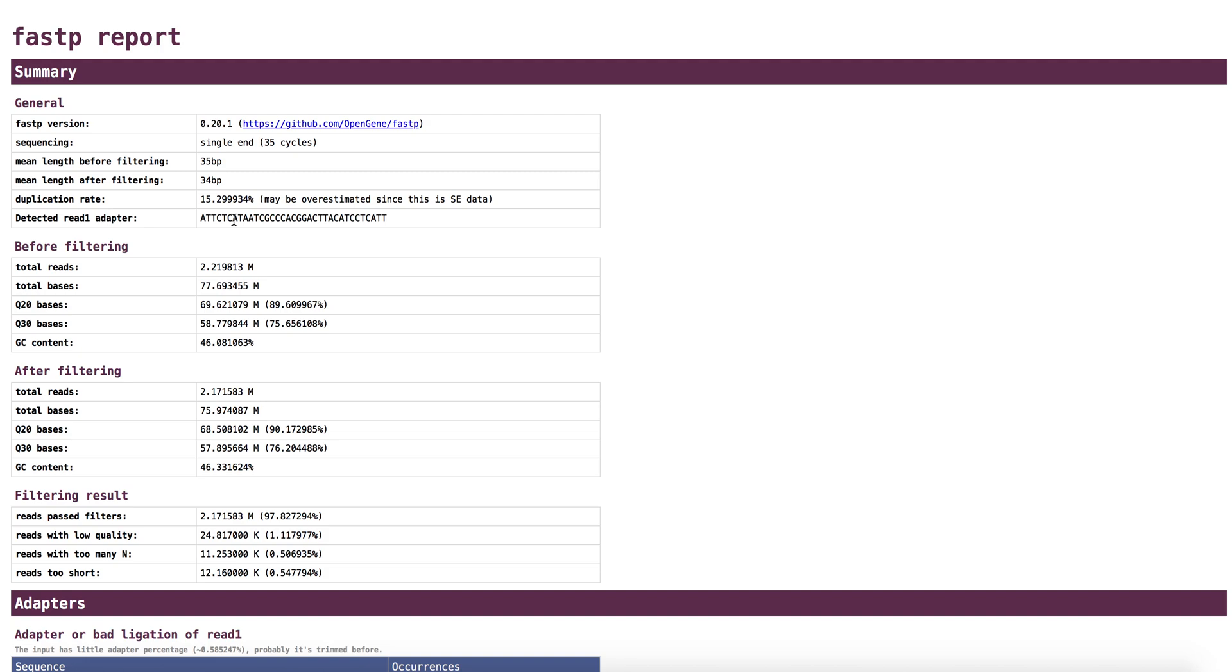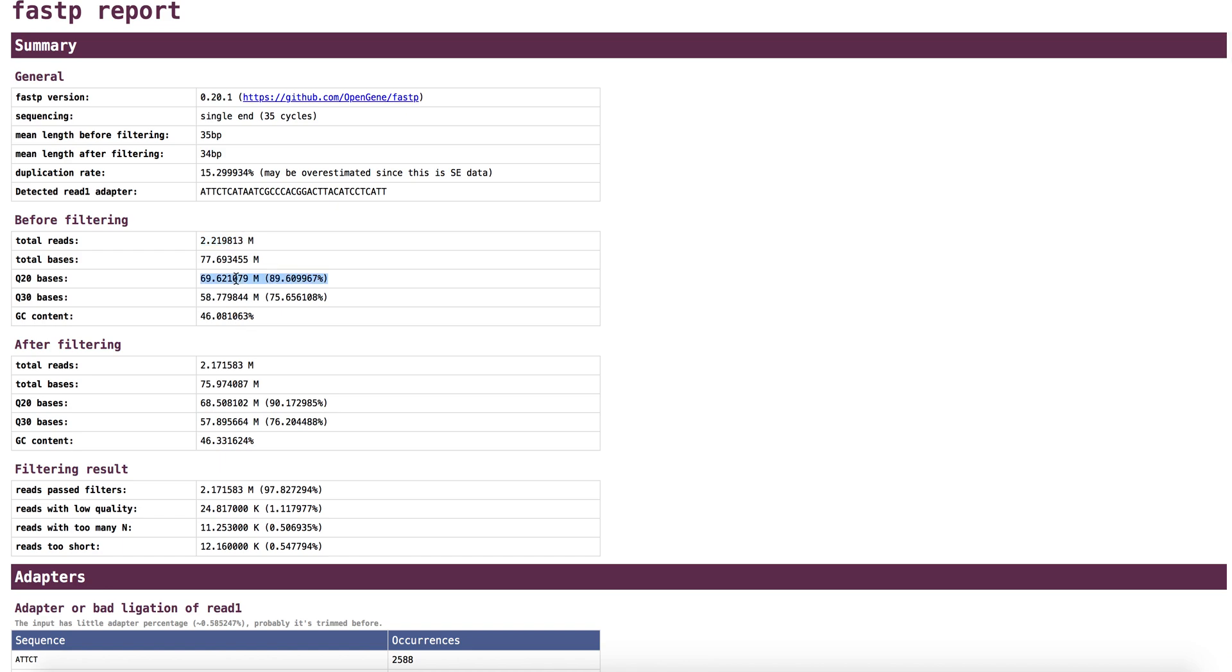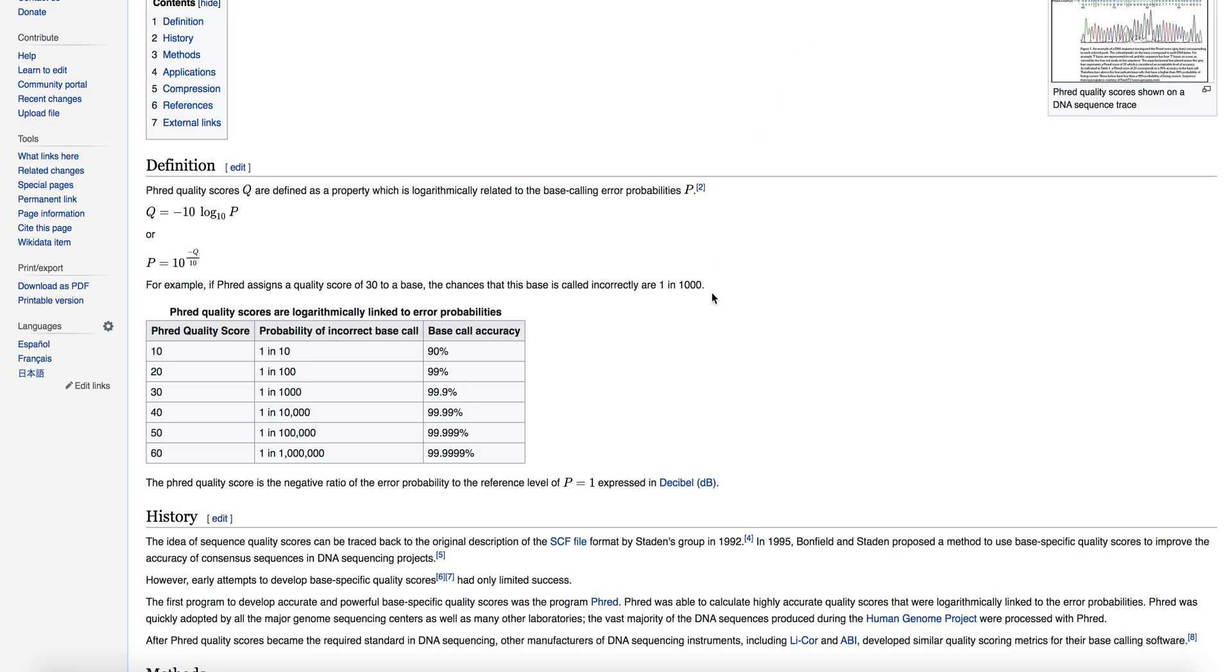And if it's detecting an adapter that is quite popular, it will also provide the name of that adapter, the TruSeq adapter or whatnot. This was actually a very small file. There's only 2.22 million reads. It provides what percentage of bases are greater than 20 PHRED score and what are greater than 30 PHRED score. I'll do a quick definition of that. The PHRED score is provided by the sequencing machine, the sequencing platform, and provides a measure of base call accuracy. You can see at a score of 30, the base call accuracy is estimated to be 99.9%, whereas at 20, it's only estimated to be 99%. Typically, you want for most of your reads and for most of your bases, you want it to be above 30.